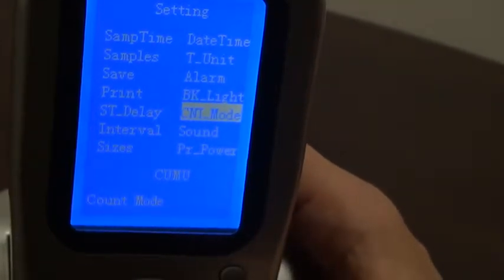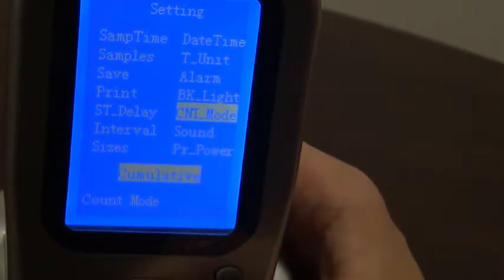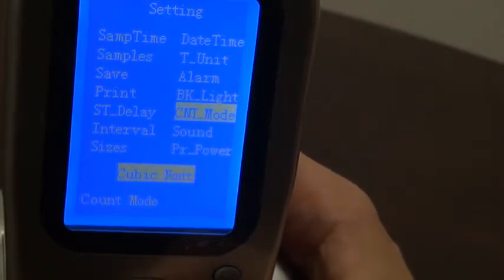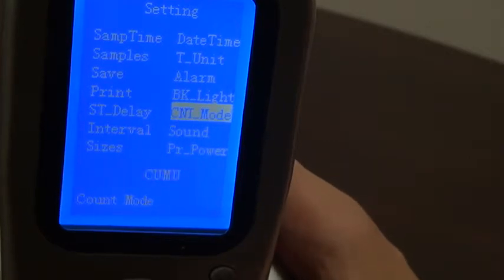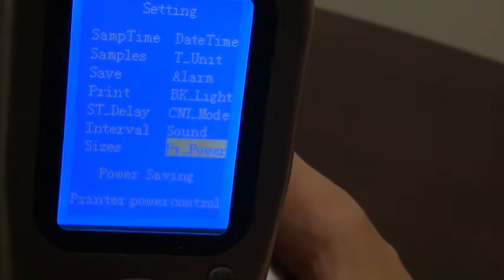The count mode offers a few options. We have cumulative mode and differential mode, which are purely counting modes. We also have concentration modes, which are counts per liter, counts per cubic meter, and counts per cubic foot. We'll leave it in cumulative mode for this demonstration. Lastly, we have sound options — whether or not we hear beeps with the keypad — and printer power control options, in this case power saving mode.